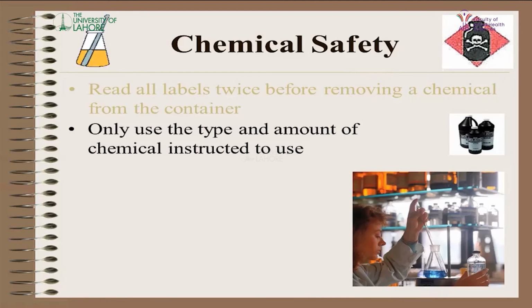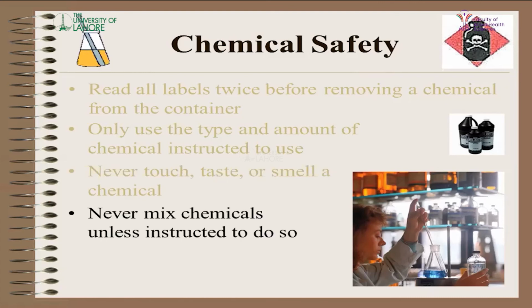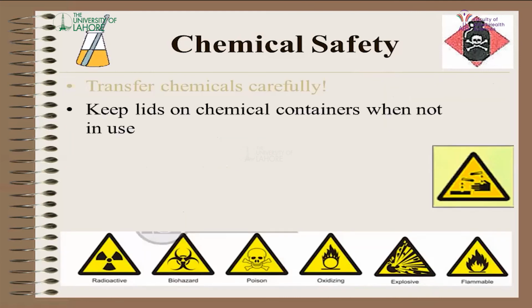properly. Only use the type and amount of chemical instructed to be used in the procedure. So do not alter any type of chemical by yourself. Never touch, taste or smell any chemical. Never mix chemicals until instructed to do so. So chemicals are always to be thought of as dangerous.